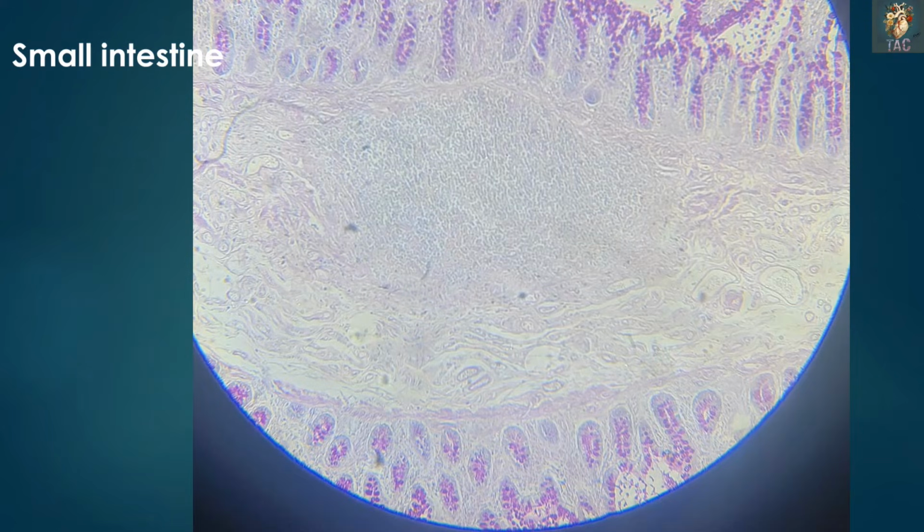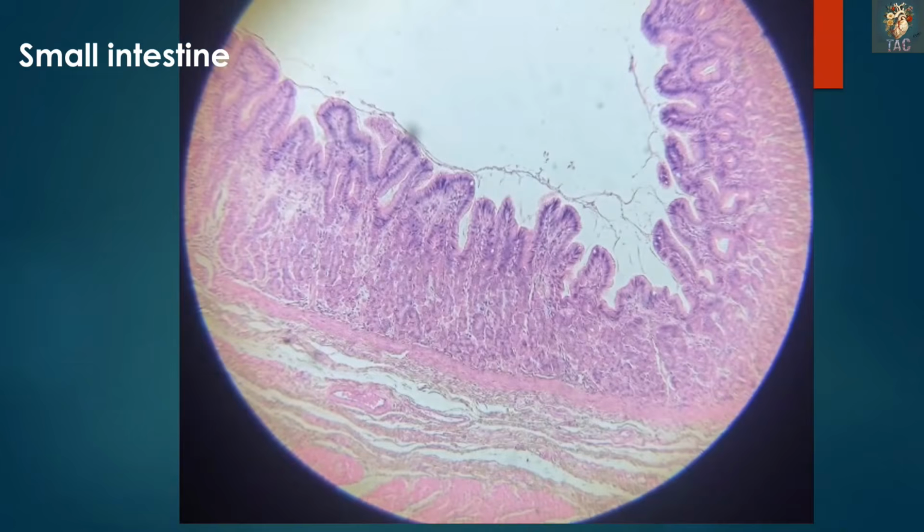Again the same slide at further higher magnification to show you the lymphatic aggregates over here, and also these are the glands of the ileum which are present in the mucosa. This one is another slide for the small intestine. Now your important point to remember is that this one is the whole thickness of the mucosa, and this is the muscularis mucosae and then the submucosa.